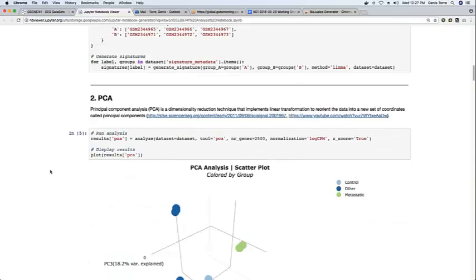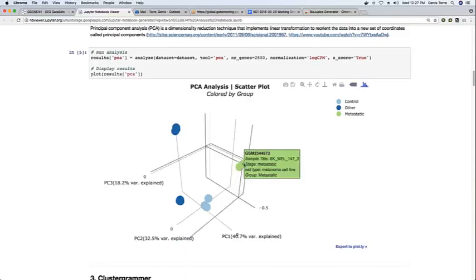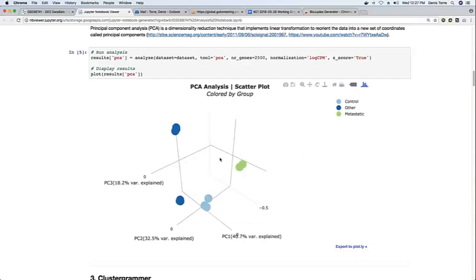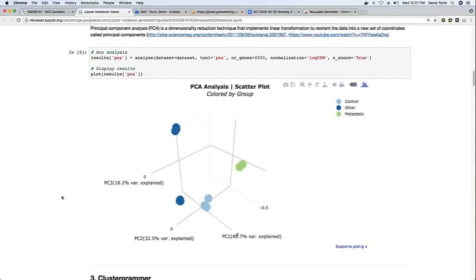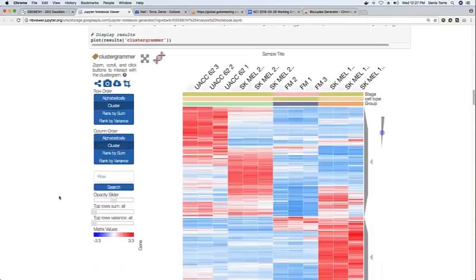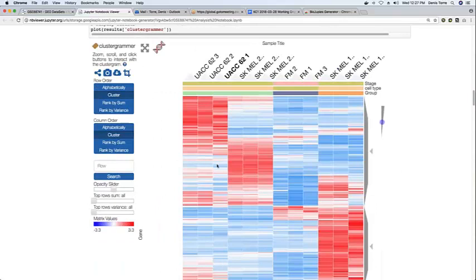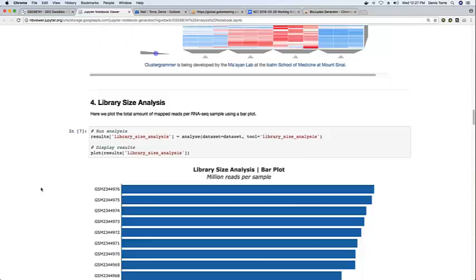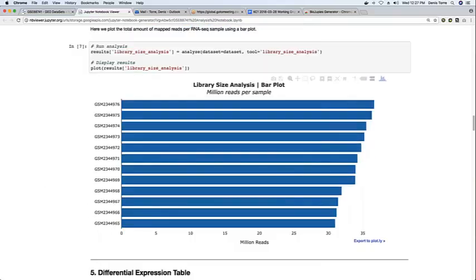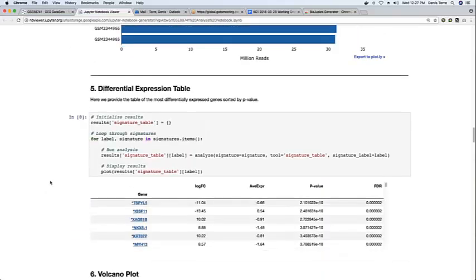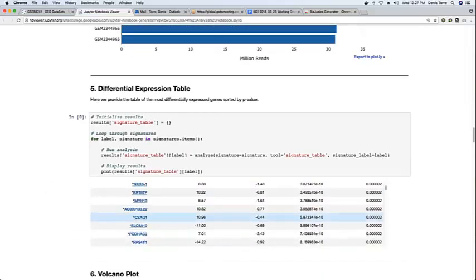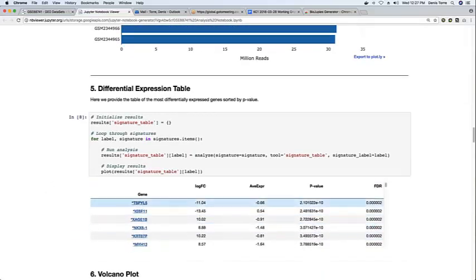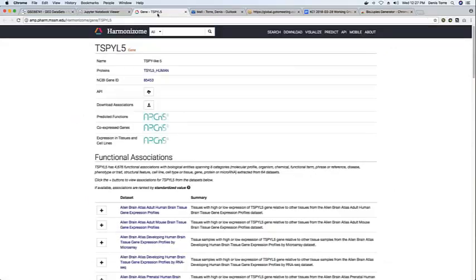And then the rest of the notebook contains interactive visualizations and plots, such as a PCA, heat maps to explore the data, bar charts showing the library sizes, summaries of the differential expression analysis, including links to external databases, which contain information about genes.